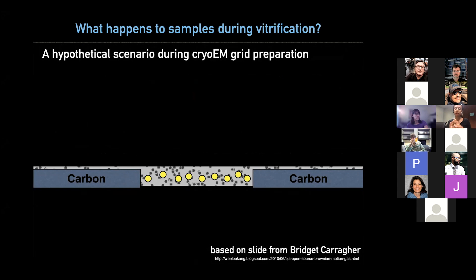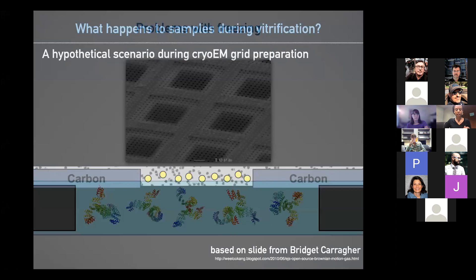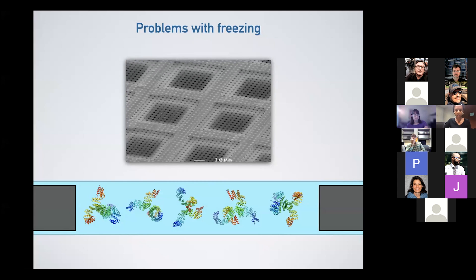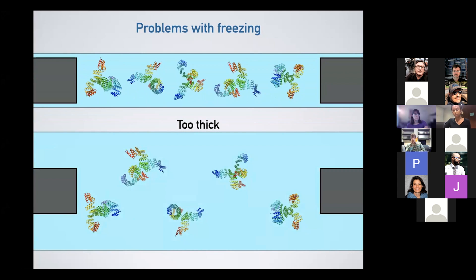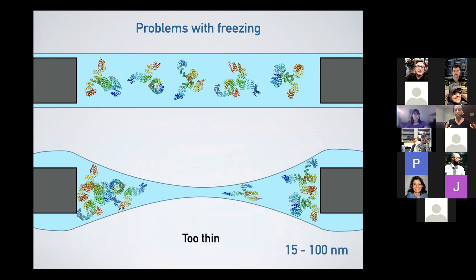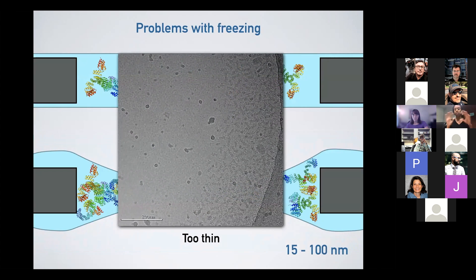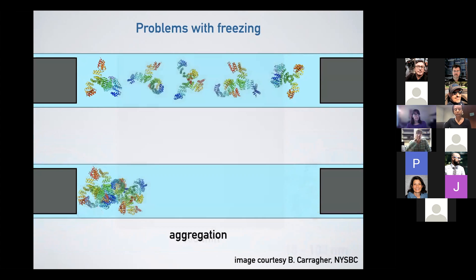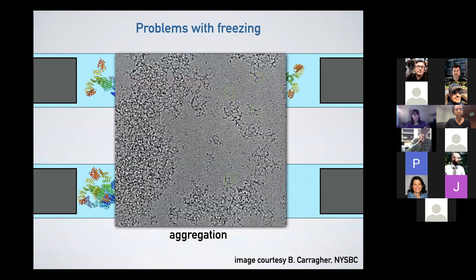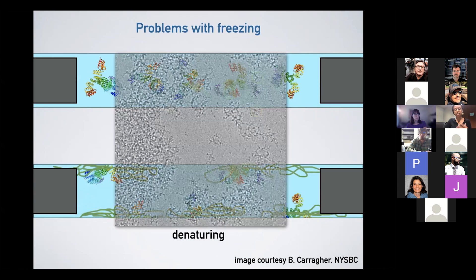Here I'm highlighting an example grid that is wholly carbon to orient you. Some problems you can run into: first, your sample may be too thick — above the optimal range of 15 to 100 nanometers, which varies based on your sample. You can also see that your layer is too thin, where you're losing your sample and seeing it aggregate along the edges of the hole. You can also run into issues with aggregation if it's being pushed towards the edge of the hole or concentrated at the air-water interface, where you're more likely to see denaturing of your protein. This image highlights that aggregation and denaturing can occur at the same time.